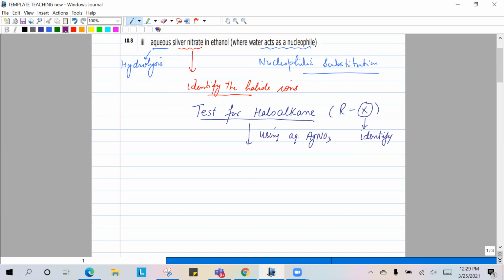The good thing about this reaction is that you will perform the experiment in the same way, but what you record helps us get three different results or pieces of information.